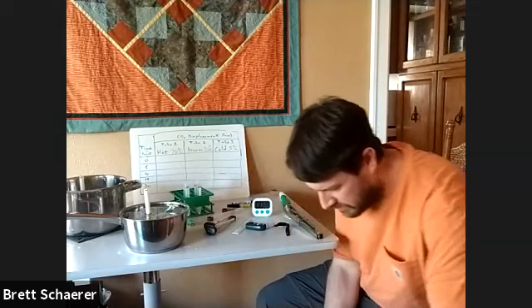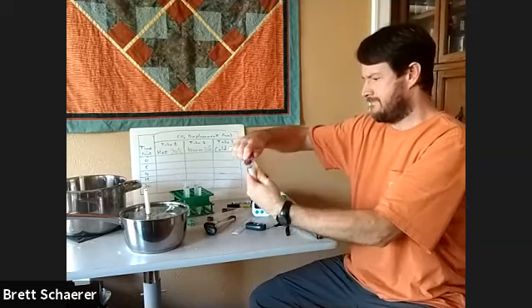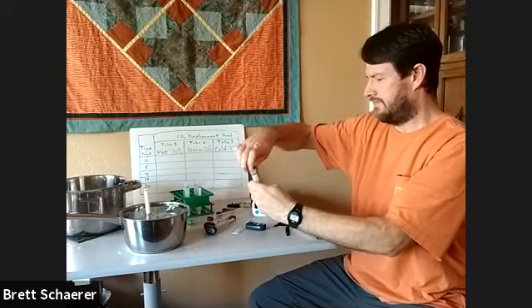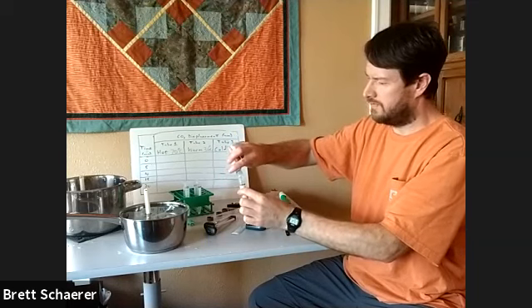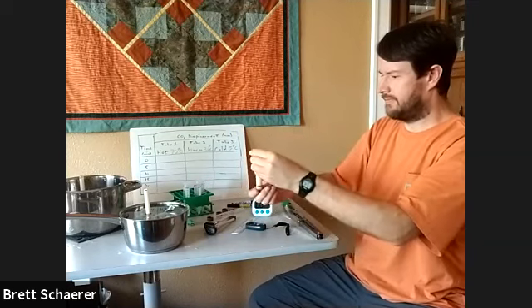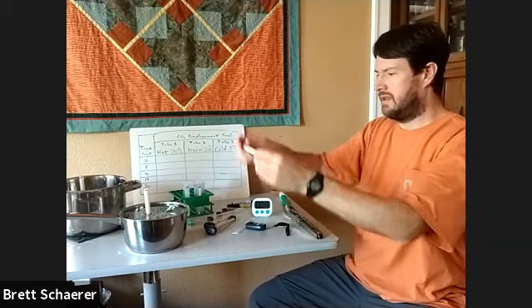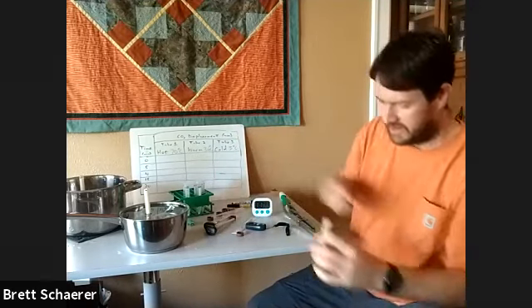Just leave it cold. The exact same way. Together. And then we will put these into the cold tube.